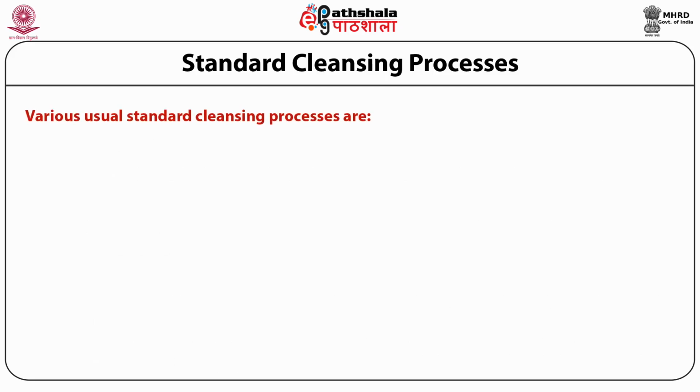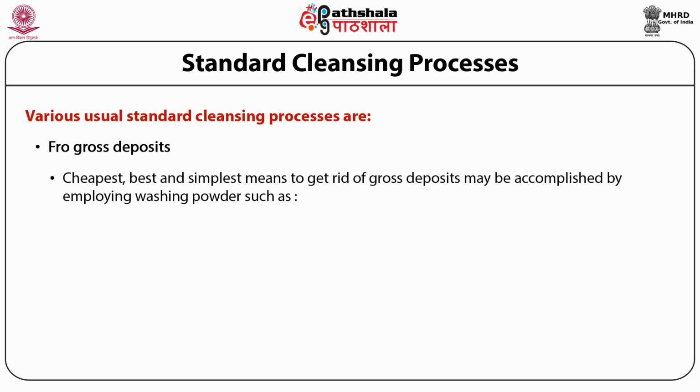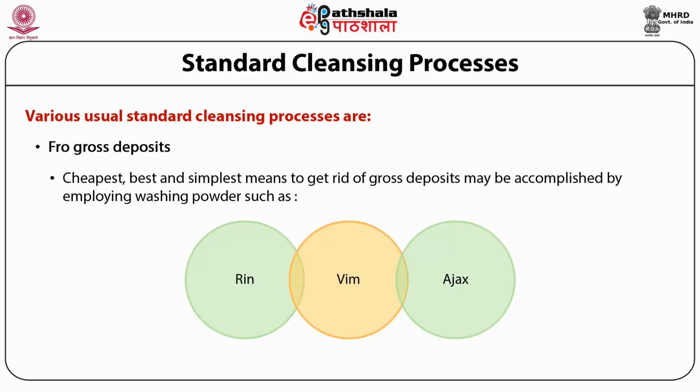Number 4. Gross deposits. The cheapest, best and simplest means to get rid of gross deposits may be accomplished by employing commercial household washing powder containing an abrasive component that does not necessarily scratch the glass surface at all, such as Rin, Vim, Ajax, etc.